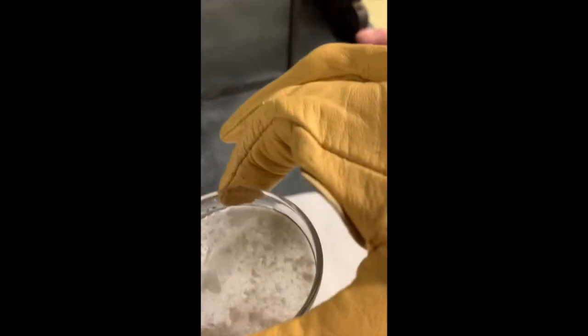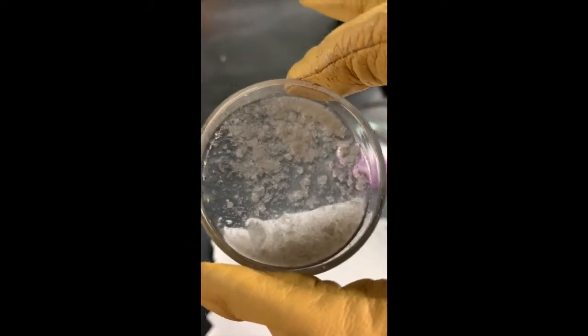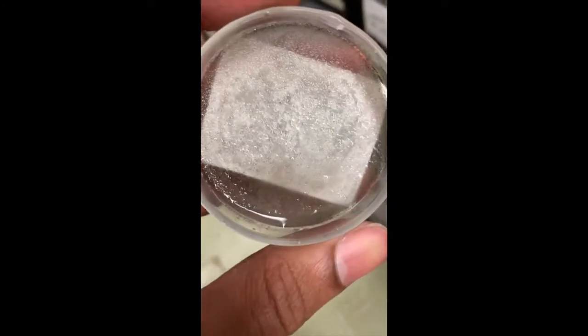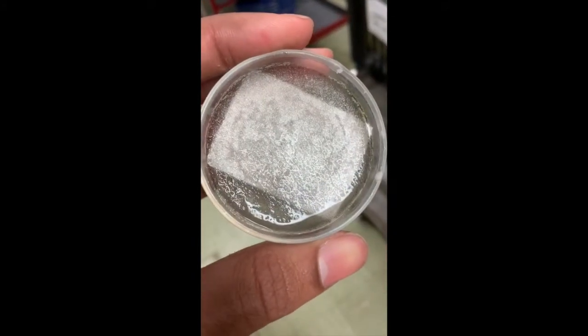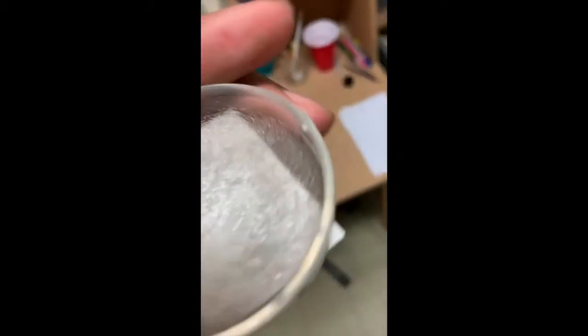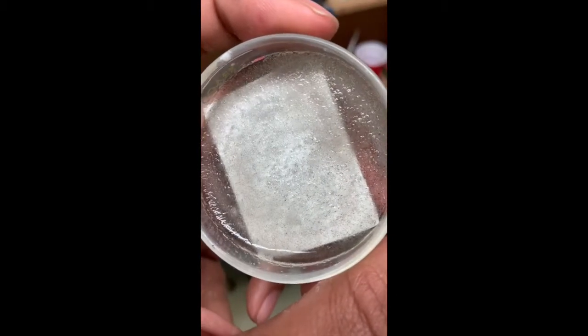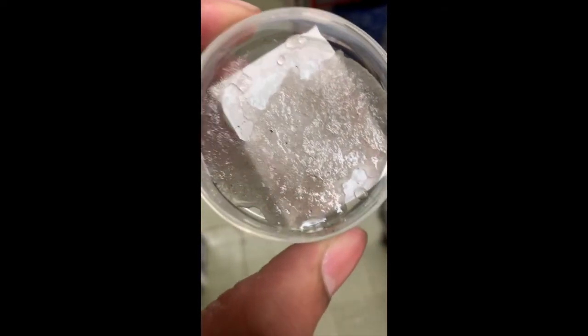So look at that — we got some beautiful crystals forming. Science, it's crazy. Here's our final product from yesterday. A little bit of liquid but still crystallized. It's beautiful. Look at the other one — it's about a solid crystal right there. A little bit of water but still very solid, and here we have another one — a little bit better.